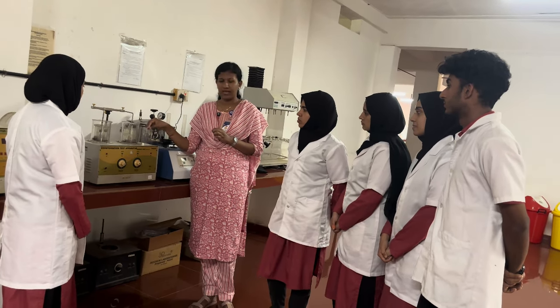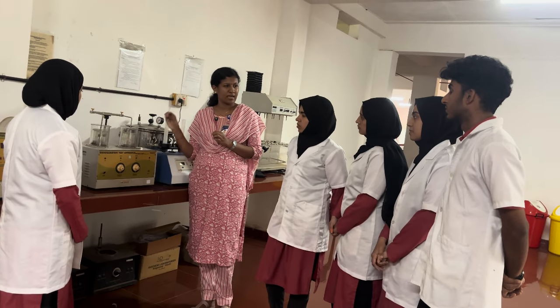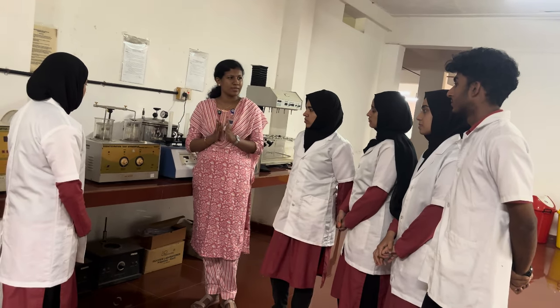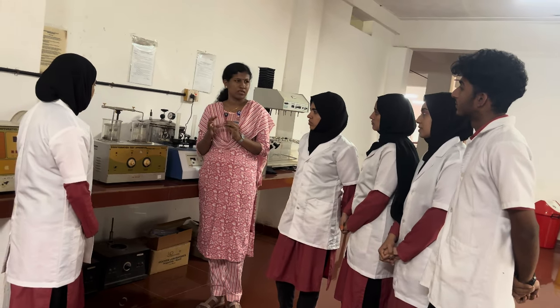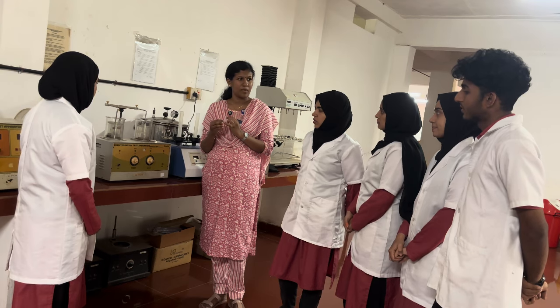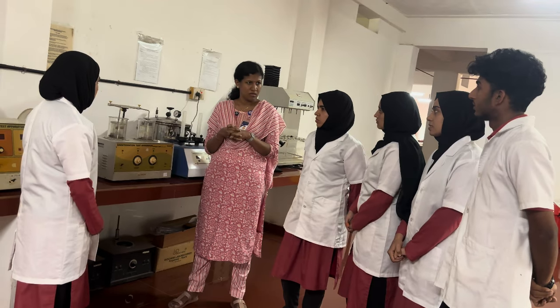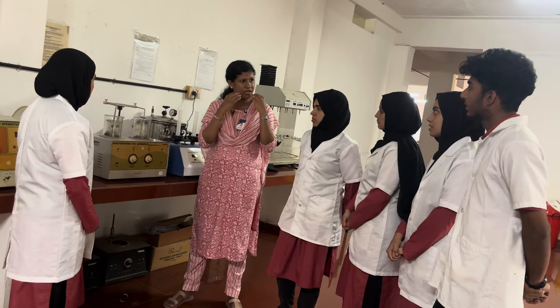We are doing the disintegration test on certain types of tablets, and we are not conducting the disintegration test as a quality control test for some types of tablets. Which are they? We are not conducting disintegration for those tablets. Okay, effervescent tablets. Then chewable tablets. Why are we not conducting a disintegration test for chewable tablets? Because they are already disintegrated in the mouth.